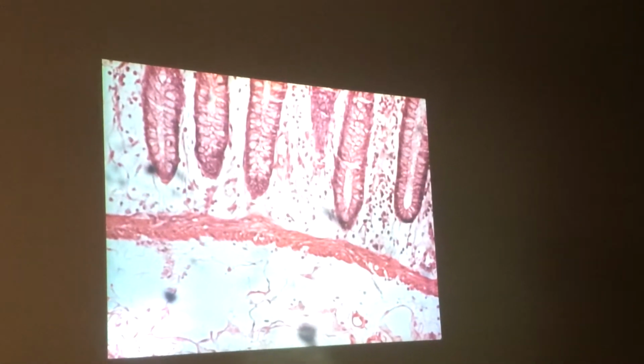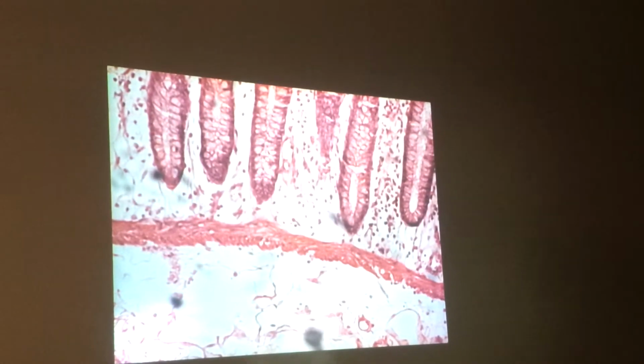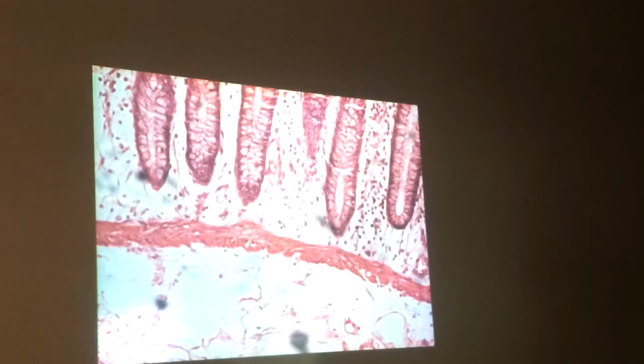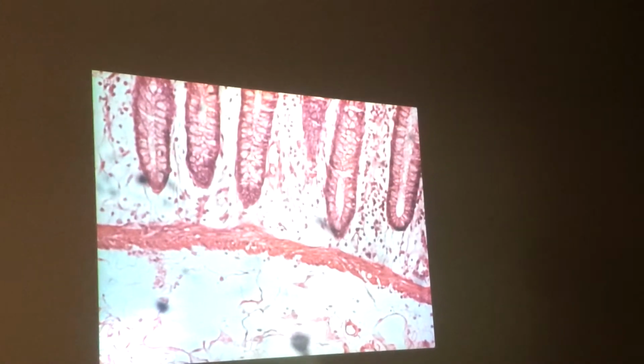All right, now let's go down below. The colon is my favorite one of these intestinal slides. Seriously, the colon kind of shows things. As much problems as people have with the colon sometimes, it is organized. Now, with my pointer, if you can see, maybe, it's kind of halfway. With the darker it is up there, that's kind of working pretty good.